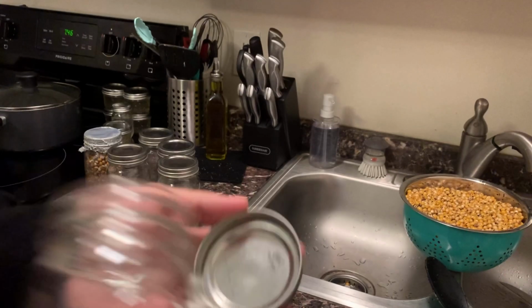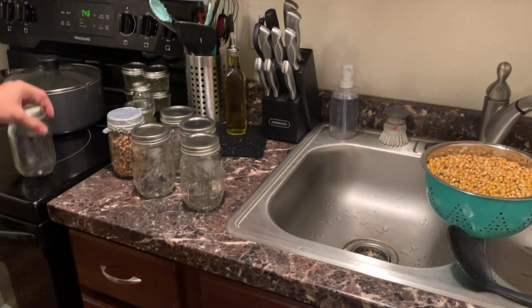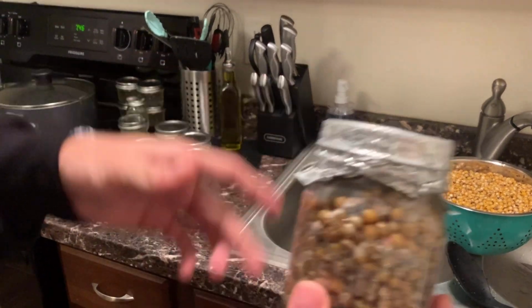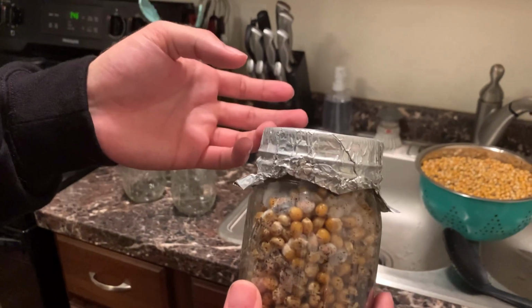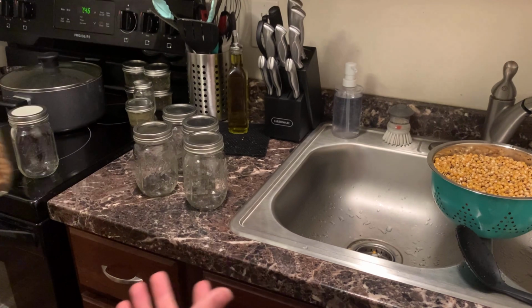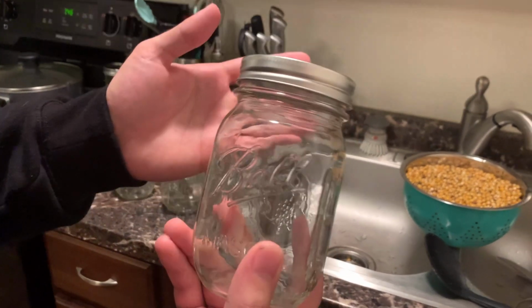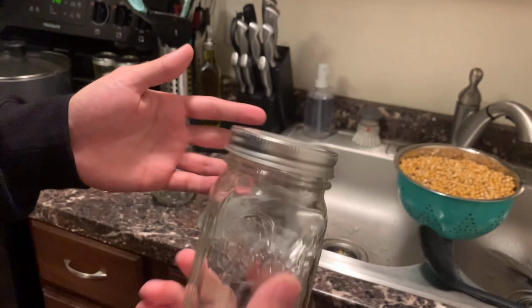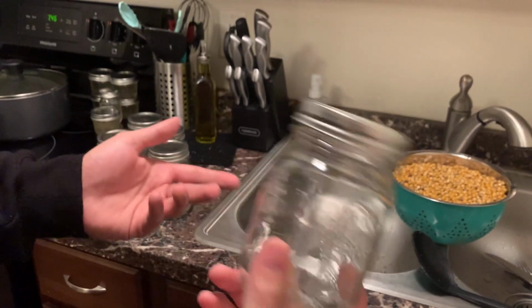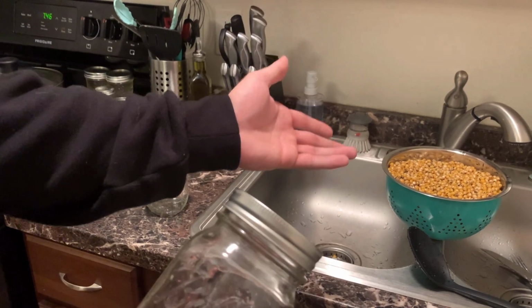So the lid's gonna be like that on the jar, pretty much like this. Some people like to wrap it in tinfoil. As you can see with this spawn jar, that's what I've done. I kind of stopped doing this just because it's an extra step. I feel like you can do it if you want, but the next step is to fill up your spawn jars. Up to this point, you don't need to really be too sterile. You just don't want to get any shit inside of your spawn.